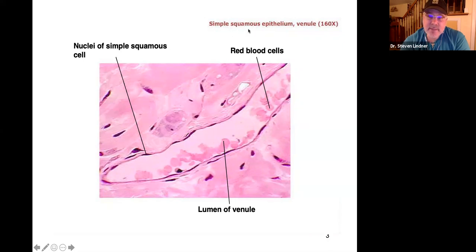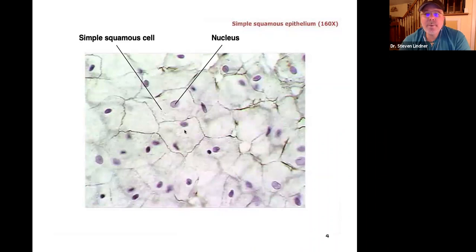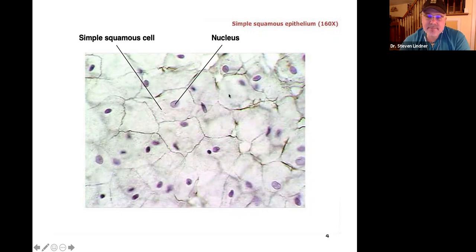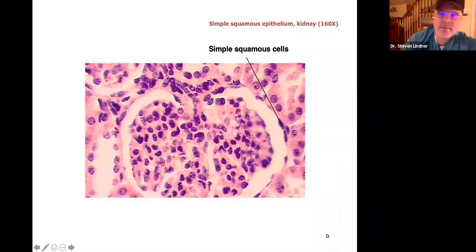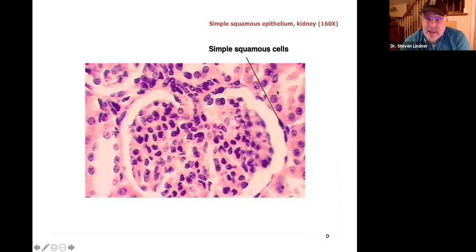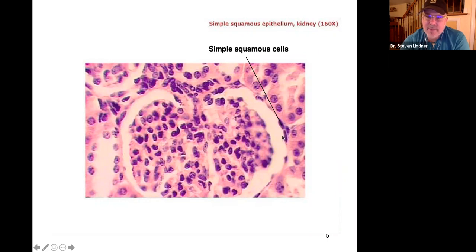You don't need to identify whether it's a vein specifically. Here we have central nuclei — the nuclei are in the center, the cells are very flat and irregular. This is simple squamous epithelium. Here's another example with a lumen lined by flat, irregular cells — this is the kidney. That flat nucleus confirms it's simple squamous epithelium. We're not looking at the cuboidal cells around the outside.